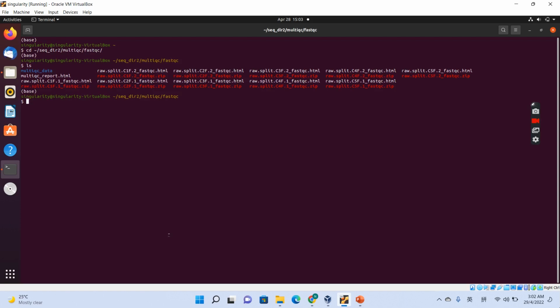So you can see here, you have all the FASTQC.html files here. Inside the same directory or the same folder where you keep all the FASTQC reports, you can just type MULTIQC. But of course, I can do this because I already installed MULTIQC using Bioconda, so I can directly call out MULTIQC.